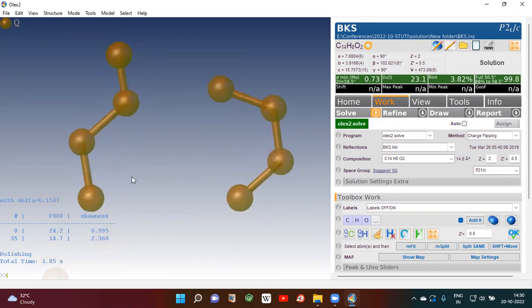I know my molecules, so I know these are carbon atoms. Before that, you can see here — press F3. Once you press F3, you will see Q1, Q2, Q3, Q4 as well.